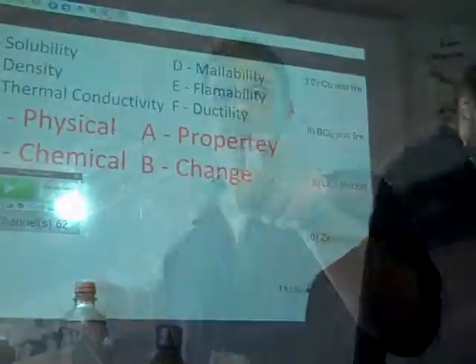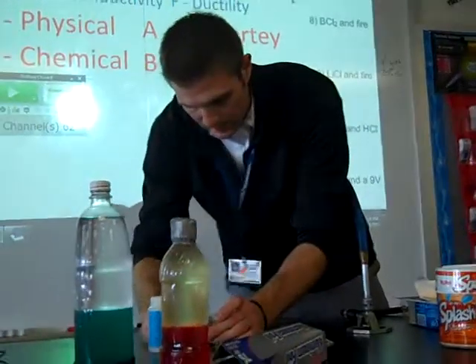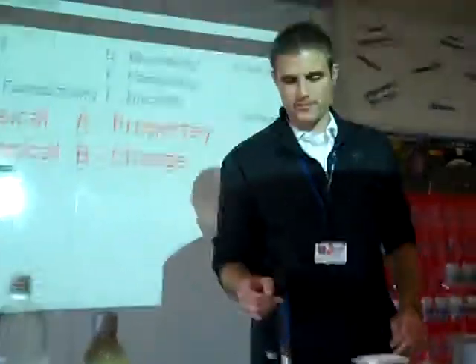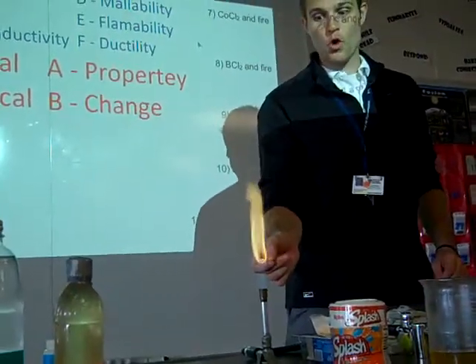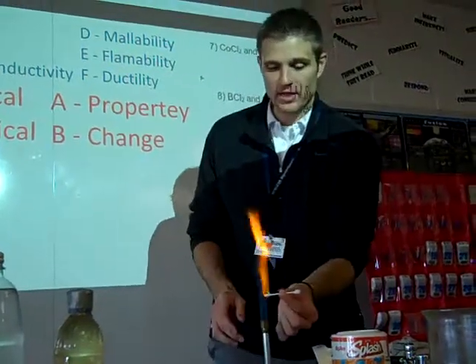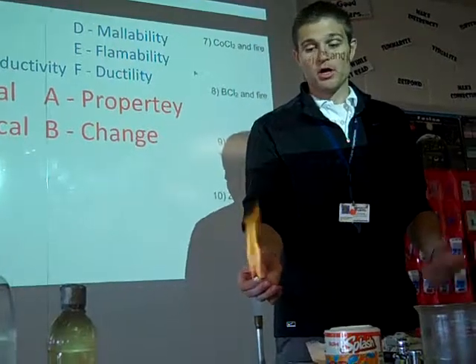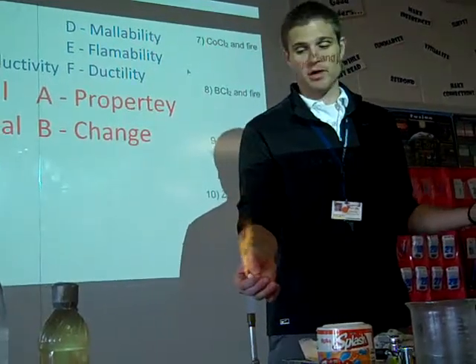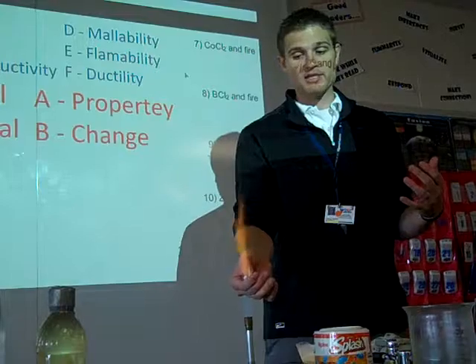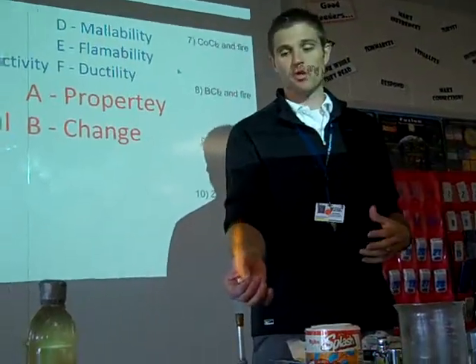No, it smells. So once again, get the Q-tip wet. I'm going to get some barium chloride on it. Okay, and let's see. Ooh. Whoa! That's awesome. Remember, regular Q-tip, barium Q-tip. So once again, this is how we make green in fireworks. If you notice, after the barium runs out, does it go back to burning like a normal Q-tip? Yeah, so that's why you get that mixture of orange in there.